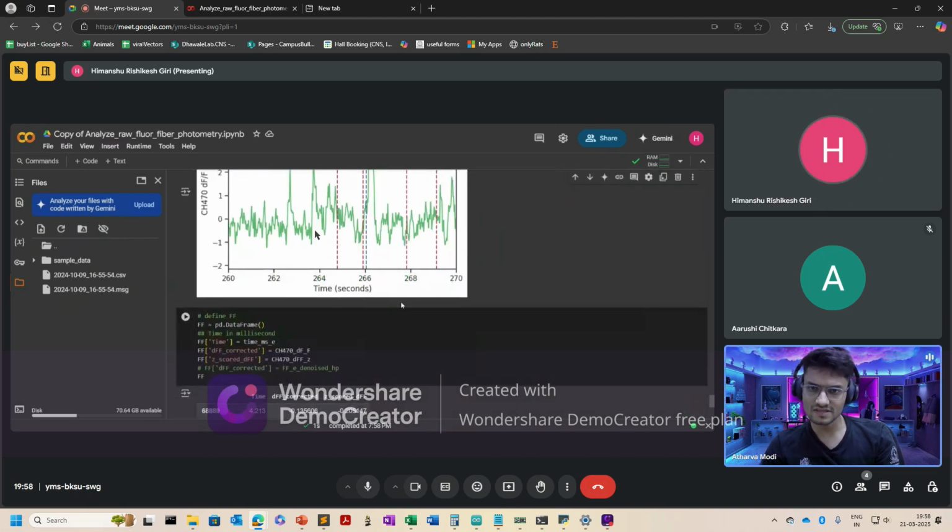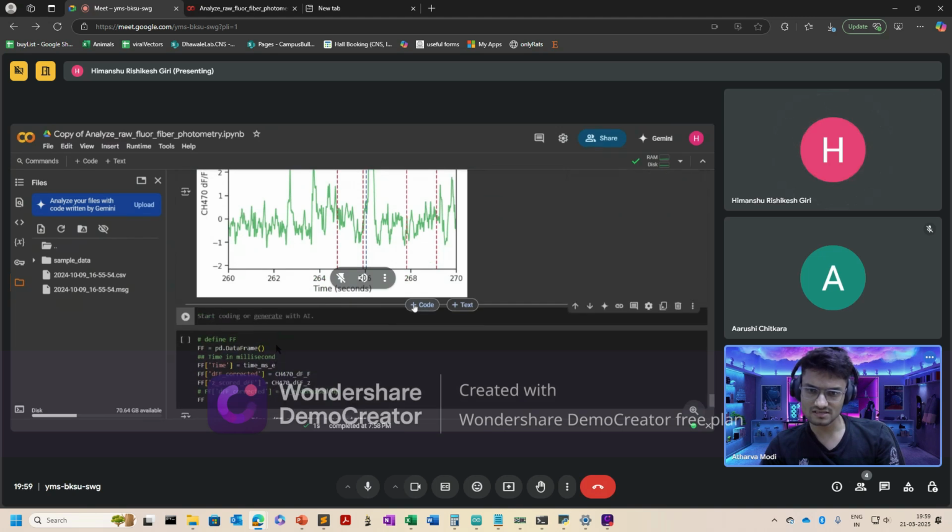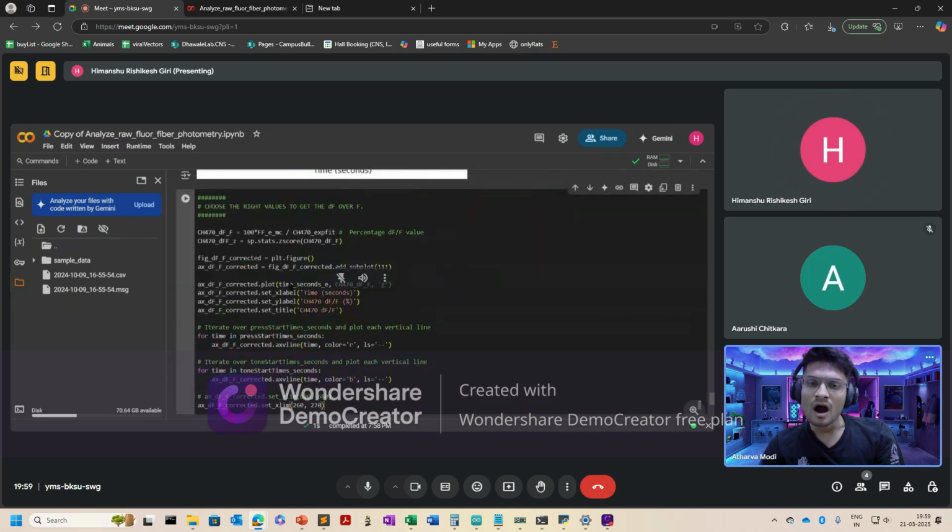Don't do the above step, like don't do that. Okay, I can do that. It doesn't matter, I'm not doing anything twice. That's more important.